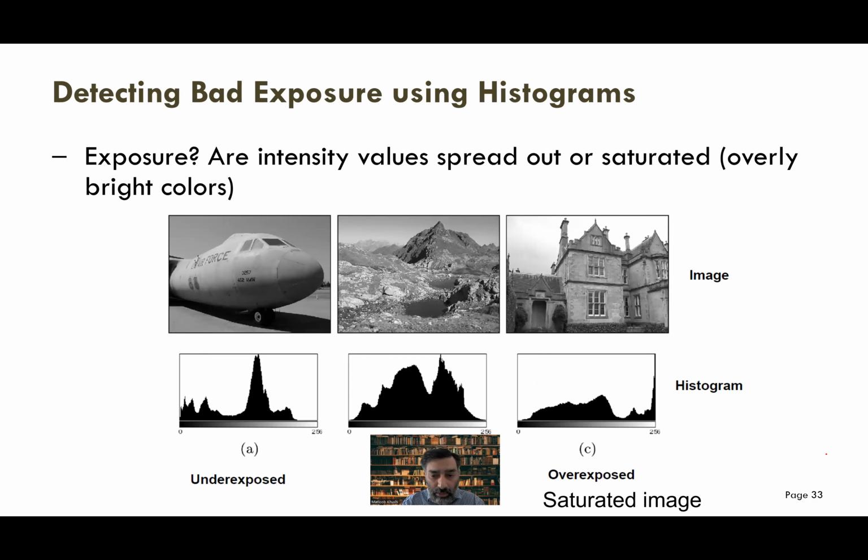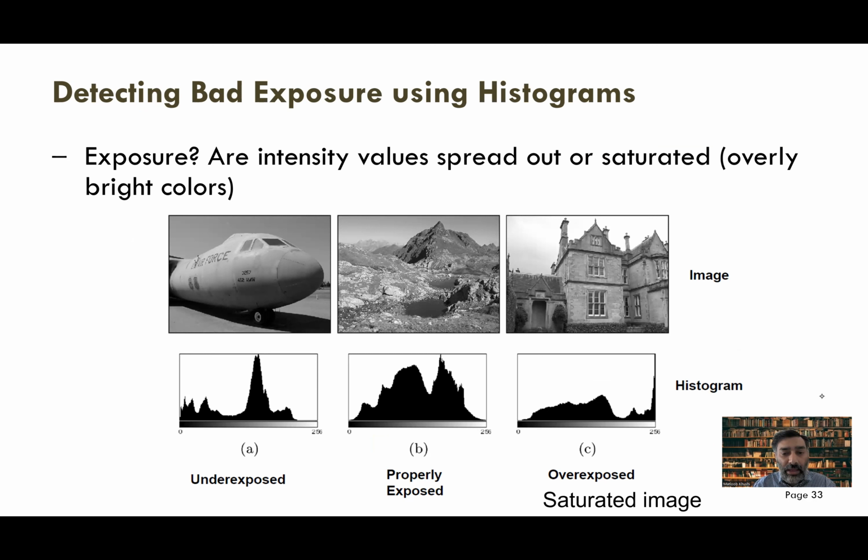Okay, now in research it is also very important to have your image appropriately exposed to the right light conditions. And you are the one who is going to let your scientist, bench biologist know that your images have a problem. Look at all these images. These three images look fairly good to work with, not really a big problem. But this one, the C1, is overexposed.